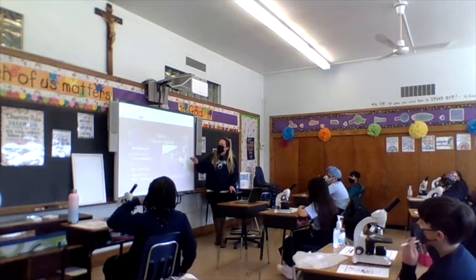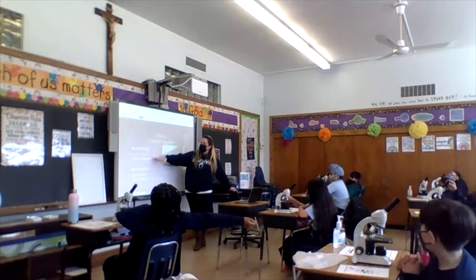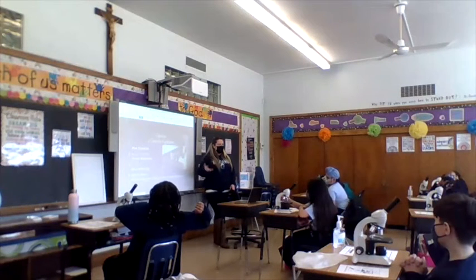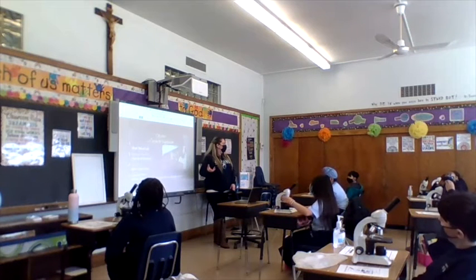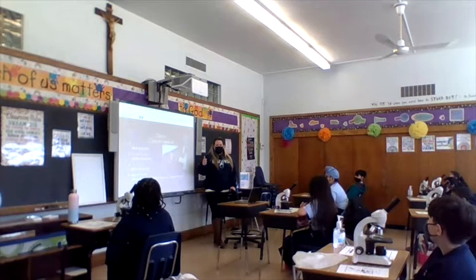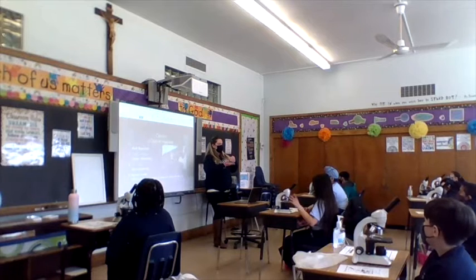So we were talking about the different lenses, right? So again, there's a red objective, then the yellow is the medium, and then the blue is high power. The highest power for our microscope is the blue one. Make sense? And you have to be careful when working with the blue one, because it could get very close to your slide when you're moving the stage.